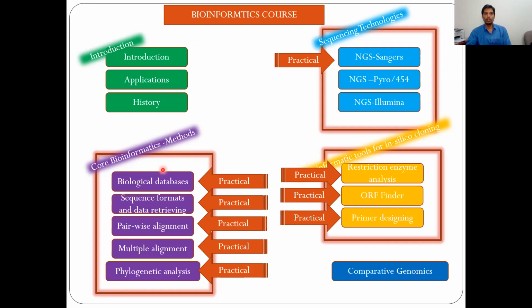This introduction part is finished, and now we are in the sequencing technologies, where we finished Sanger's and the practical also. I hope you have done it. Maybe we can see later whether you have any queries regarding it. And Pyrosequencing we have learned, and Illumina we are going to see today. With this, sequencing technologies will be complete, and then we will enter the core bioinformatics methods, which are in all your textbooks, most of the time.